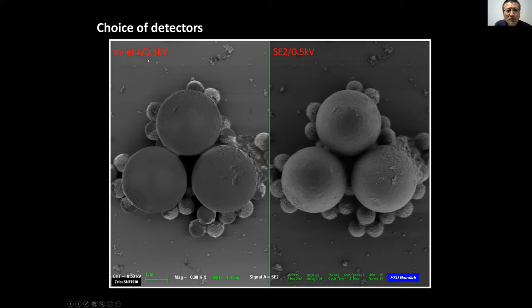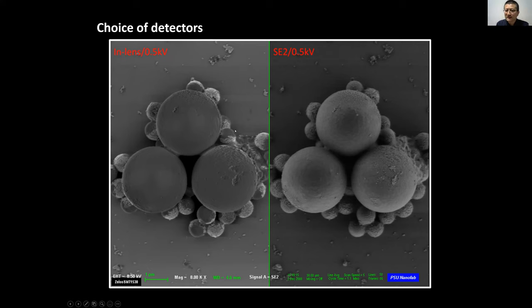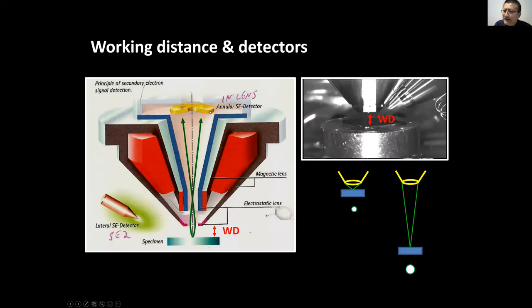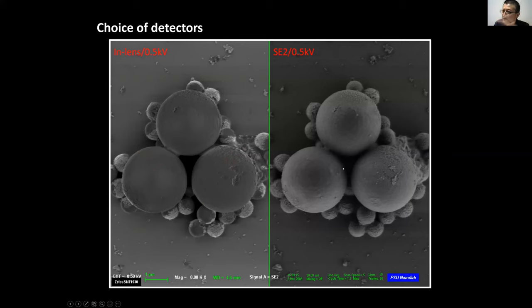Same sample, same voltage: left side uses in-lens, right side uses SE2. The right side is better — the spheres look three-dimensional, while the left side looks flat like a disc. The in-lens detector is above the sample, so it gives a projection view. SE2 is on the side, so it gives a shadowing effect that makes topography look truly three-dimensional.